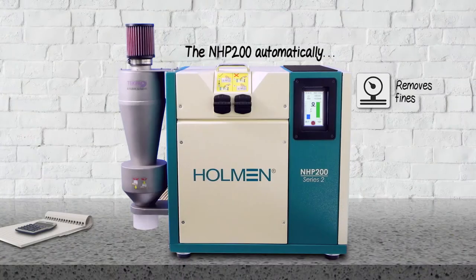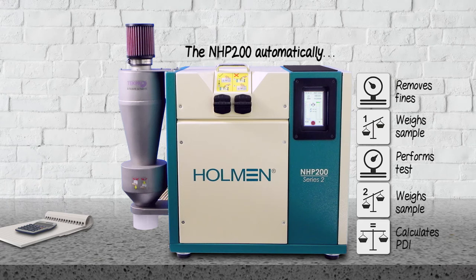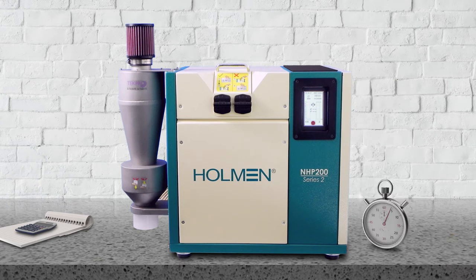It then removes any fines, weighs the sample again, performs the test, weighs the remaining sample, then calculates the PDI. This process, on average, takes about 4 minutes.